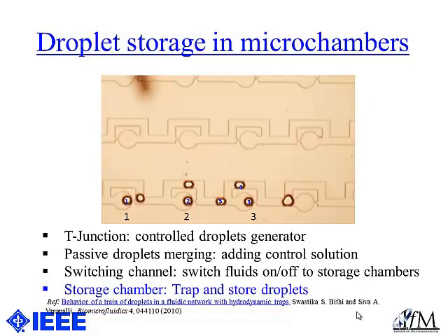This is because during the control solution delivery step, we could easily control the testing conditions, like verifying the amount of control solutions we deliver into each droplet. But to monitor each testing result, we have to identify each droplet and figure out which one is which. So by trapping those droplets in order, that's not a problem.